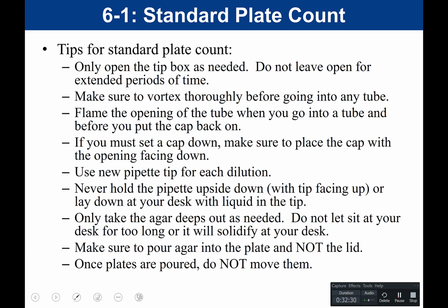You never want to set that pipette with liquid in it on your desk. Only take the agar deeps as needed. So again, you don't want to grab all 4 agar deeps at the beginning because they will solidify before you get a chance to pour them. So you only grab them as you need them.